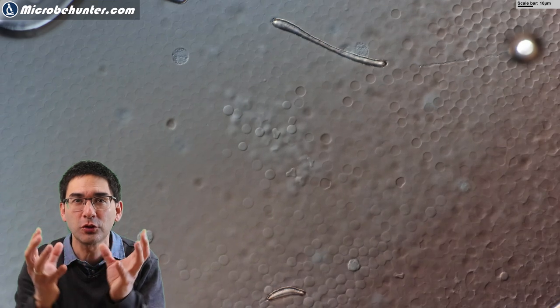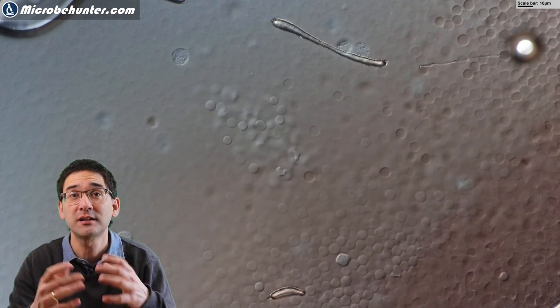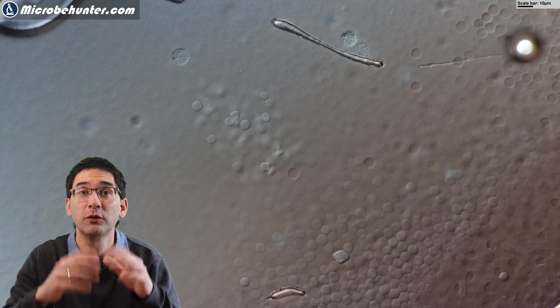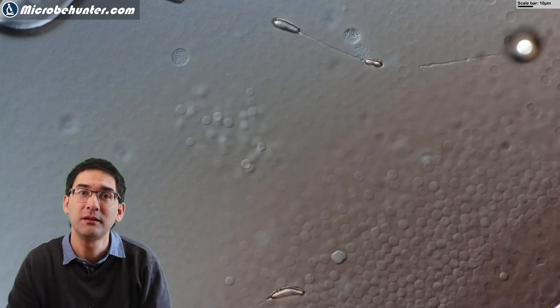I zoomed in here a little bit more. Again, a very nice and spherical shape. If you just followed along a little bit, you could see that all of a sudden those red blood cells started to disappear. Of course, they're still around, but I think they popped open, they spilled the contents out and then it made it much more difficult to actually see them.